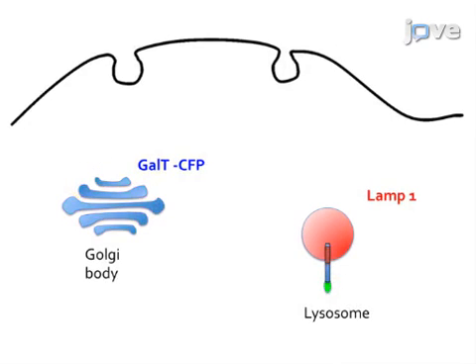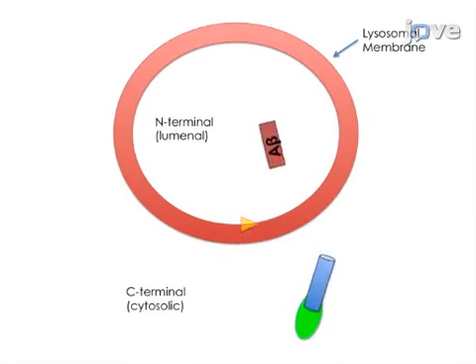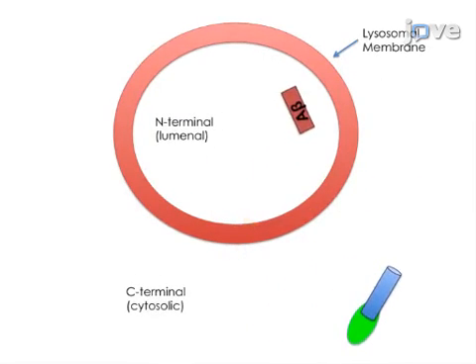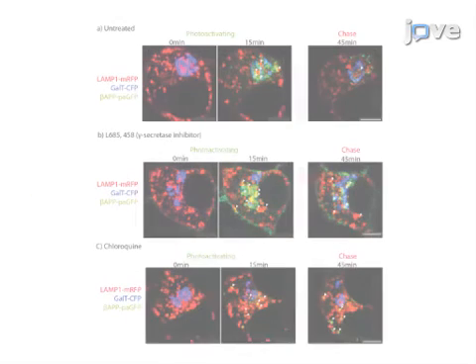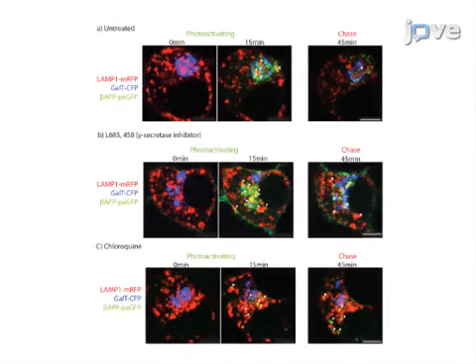Then photoactivation is stopped, and the clearance of APP from downstream compartments is imaged. Finally, trafficking of APP is analyzed using analysis software such as Imaris. Ultimately, photoactivation and confocal imaging are used to show the clearance of APP protein in live cells.